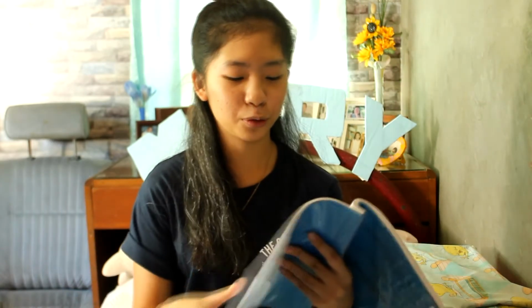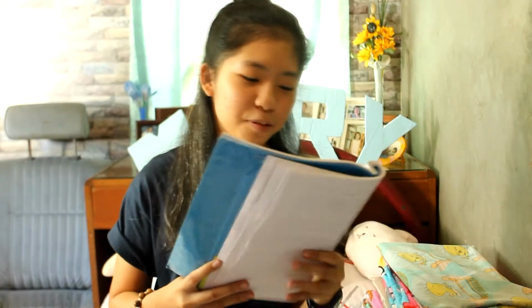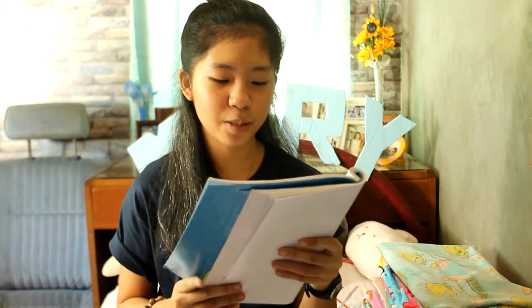Okay, so mao to siya, di ba? So, put the two specimens on the dissecting pan. Kato siya, dissecting pan na sa tao atong gipatungan ato. But, wala ta naka-dissect. And it's sad. But it's okay. So, next, kay observe and compare the two specimens externally. So, mao na siya ang atong na-observe last time when we saw the frog sa katong dissecting pan.